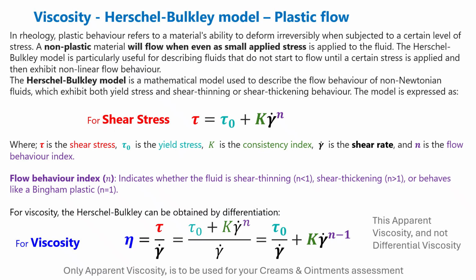Now, one of the reasons I tried to make sure that we didn't include this idea of plasticity into the models that you're working with was, one, to make sure that you got some very nice smooth data out of the instruments, but also to try and reduce the number of values you're looking at in this assessment. And so we don't have the yield stress as part of this assessment. However, the yield stress does appear in this viscosity equation that you can see down on the bottom of this slide.